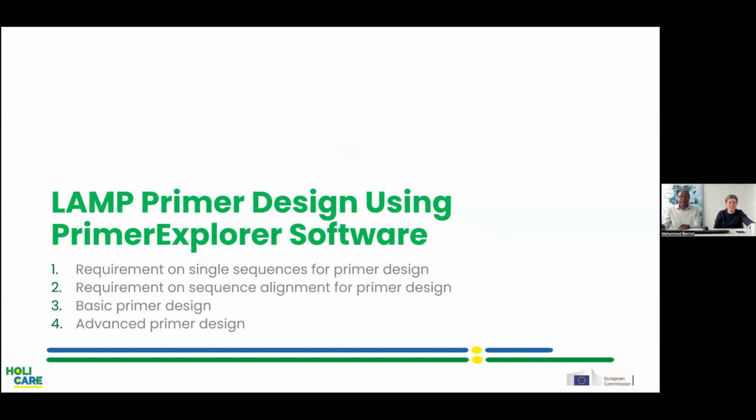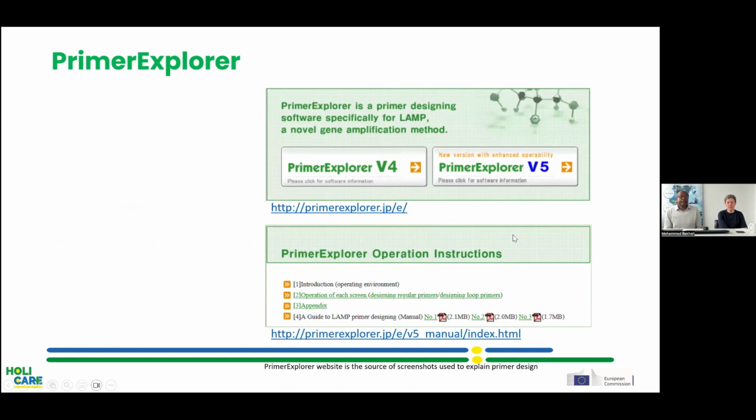Yes, we have decided here to just give a brief introduction. Actually, there's a lot of information there on LAMP primer design using Primer Explorer software. We will talk a little bit on the requirements of Primer Explorer on the sequences and sequence alignments, and a few lines on the basic primer design, but also advanced primer design. Why do we choose Primer Explorer? It's one of the first tools which are available for everyone online and free.